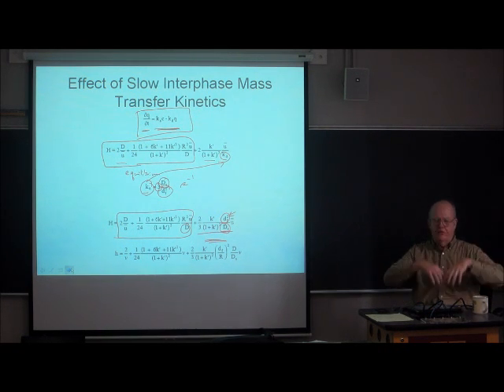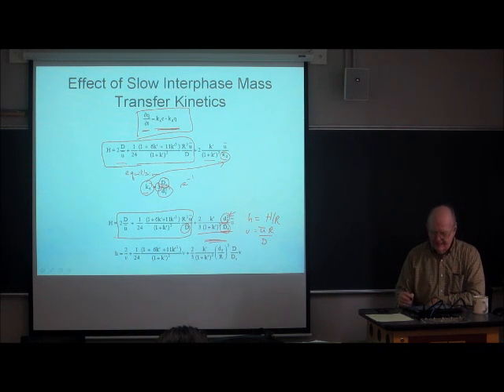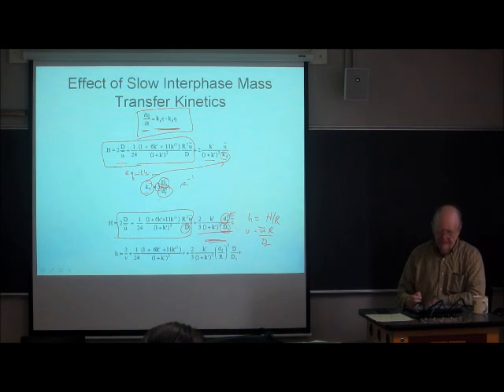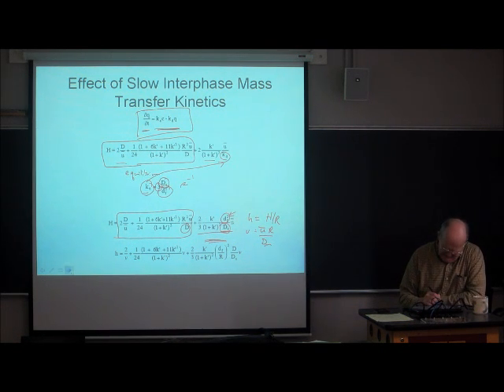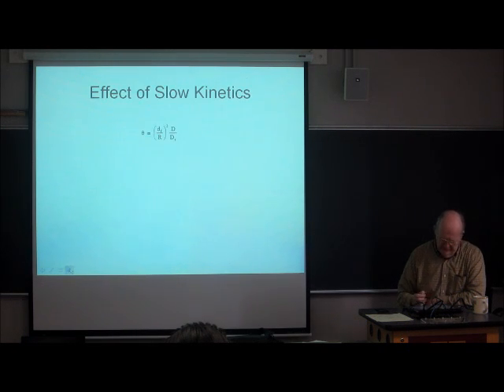Now, if I convert this whole thing to reduced units by defining little h as h over r, and nu as u bar times r over D, and to be crystal clear, we're going to use D of the mobile phase, then the reduced equation looks like this. And I'm going to rewrite this reduced equation, especially this term right here, by defining a new parameter, theta.